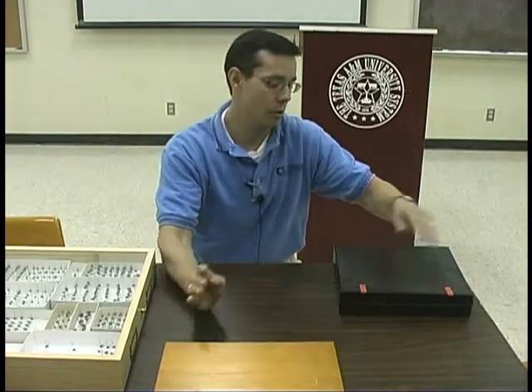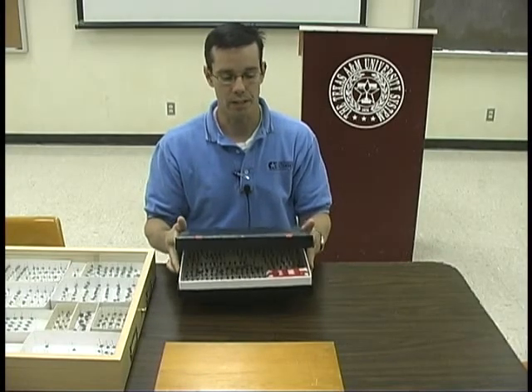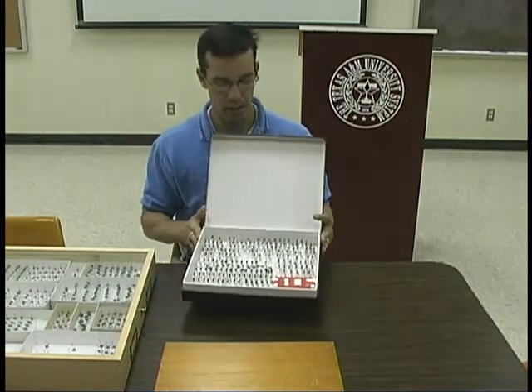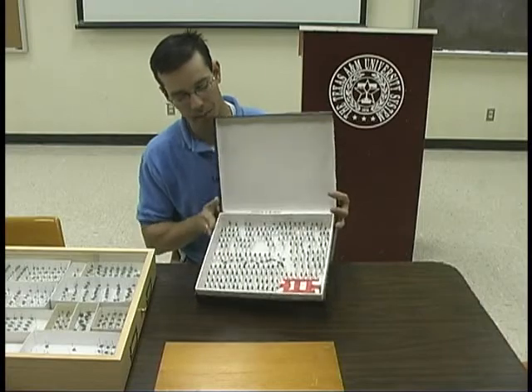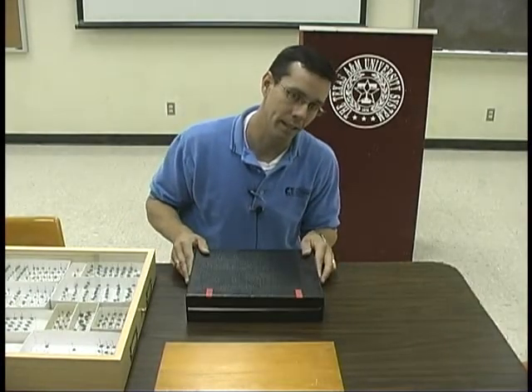An even less expensive alternative is the cardboard box. It's the same idea as the Schmidt box but not as expensive. It has a styrofoam bottom which allows you to place your insects on the inside. However, it does have some seal but insects can get in here.